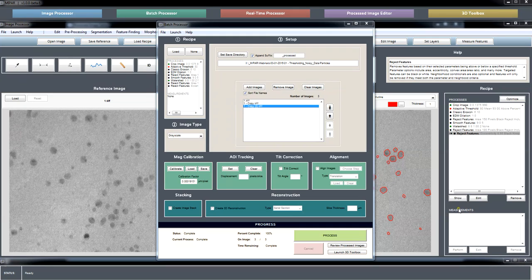Okay. As far as I can see, that is working okay, but if you encounter that, send a bug report or shoot me an email and point me to the exact setup that you were running, and I'll make sure that any problem that there is gets fixed.